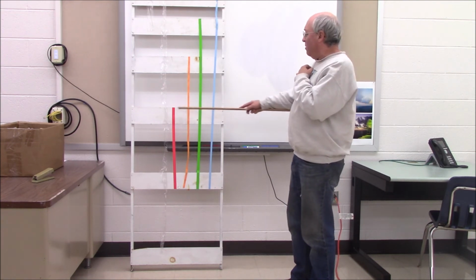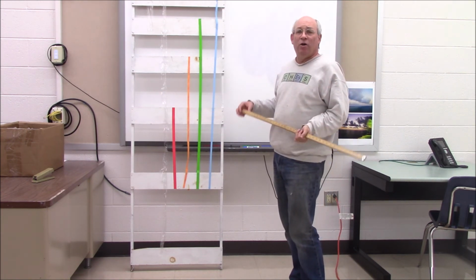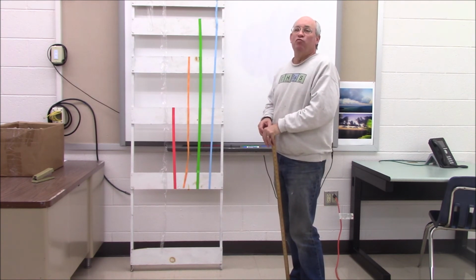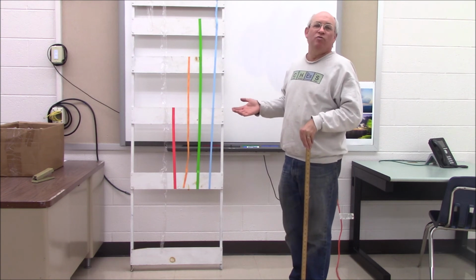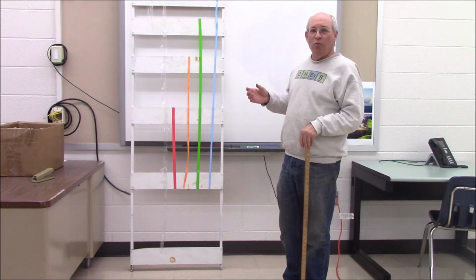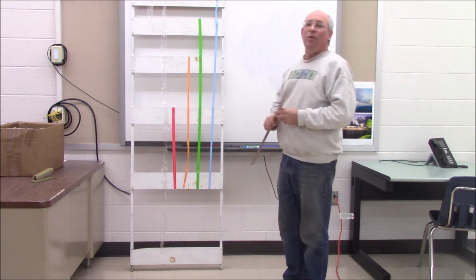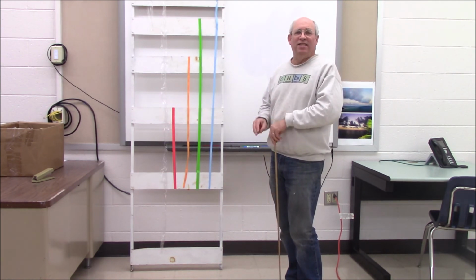So if I see, and we can take these, and even though that's red, it's not very difficult to analyze that and not just say it's red, but to say, oh, it's red with this wavelength or this frequency. And that's something we've been able to do for over 100, 150 years. So when we want to know what's in a star, we essentially point a telescope with a diffraction grating at a star. We look at the lines and we match them up to what's on Earth, because lithium atoms are the same throughout the universe.